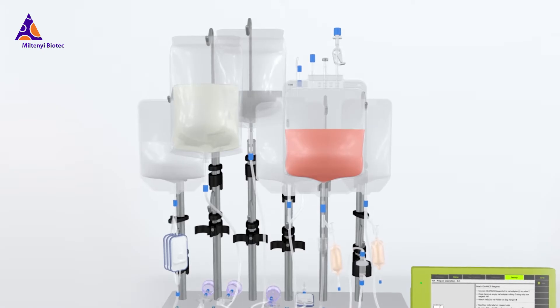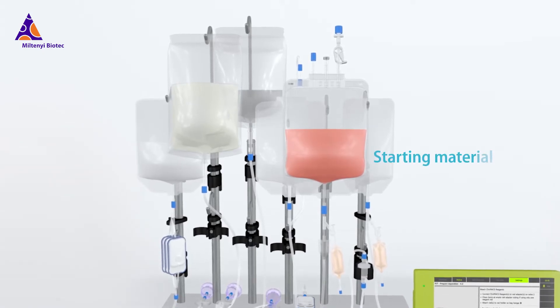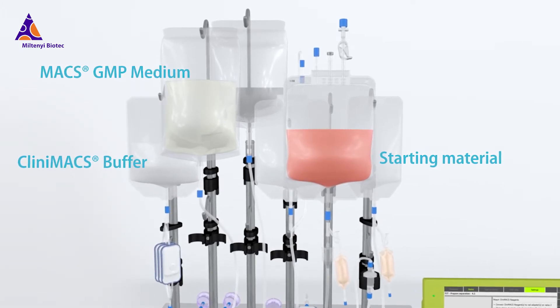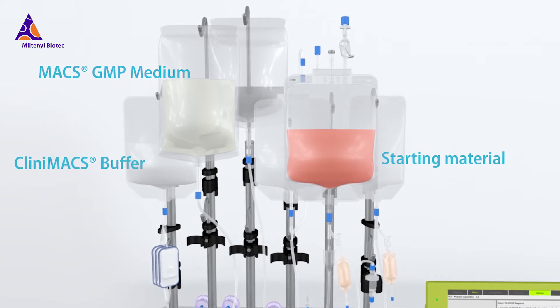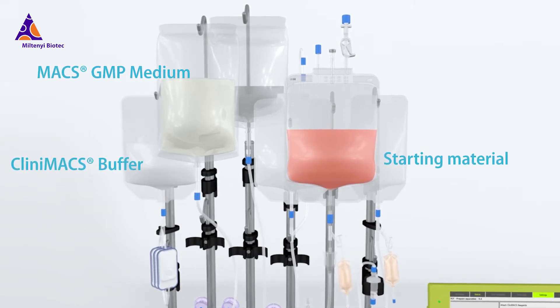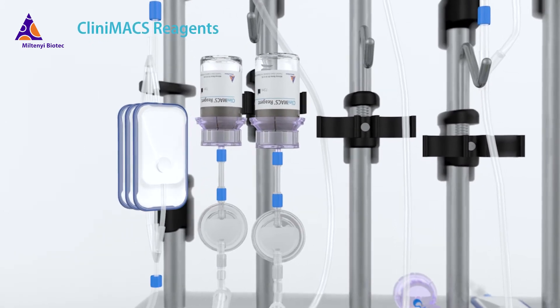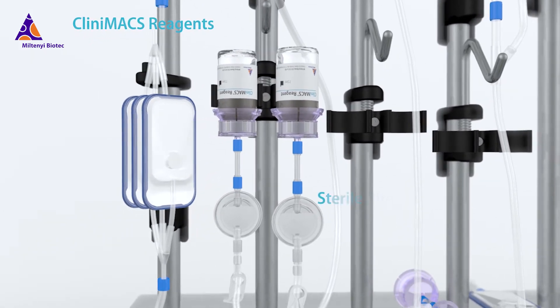To maintain a sterile environment, starting material and bags containing buffer or medium can be attached to the tubing set via sterile spike ports or sterile welding. Clinimax reagents for cell activation or separation can be plugged into the vial adapters.